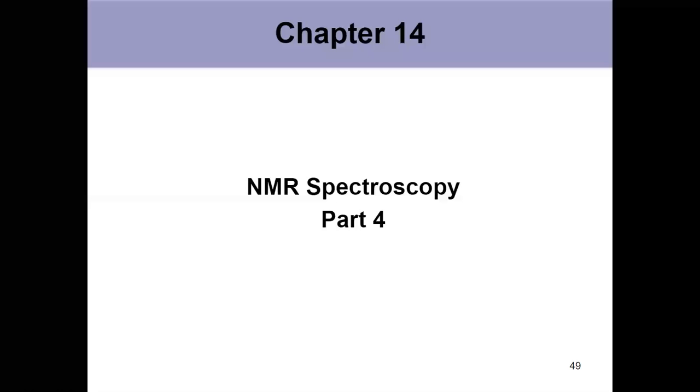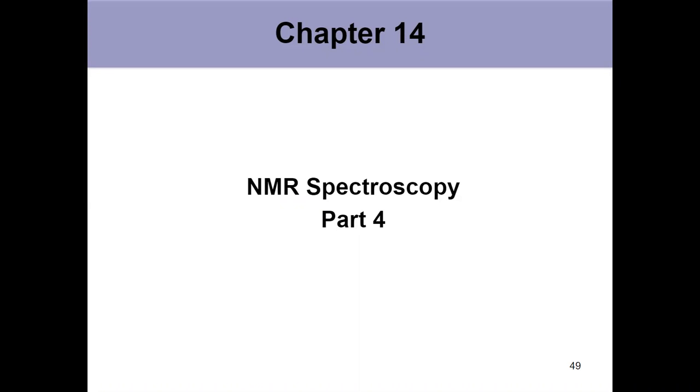I want to start part 4 here of chapter 14 by saying this video is going to cover some of the nuances of NMR, that's proton NMR specifically, and some more subtleties. I want to emphasize the importance specifically for my class of the first 3 videos and making sure you're good with all of those foundational ideas, right? Integration and splitting and where the peaks are appearing. That's really the big part of proton NMR. And here we'll talk about some other information that we can get from those spectra.